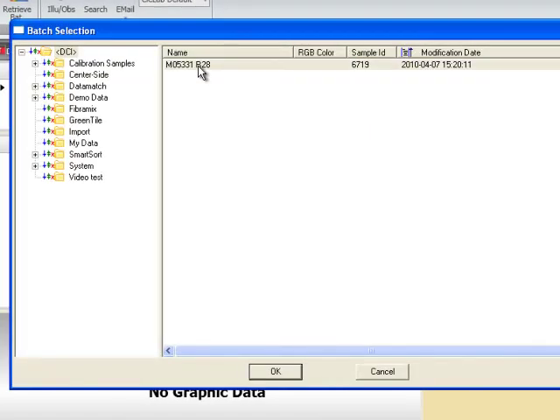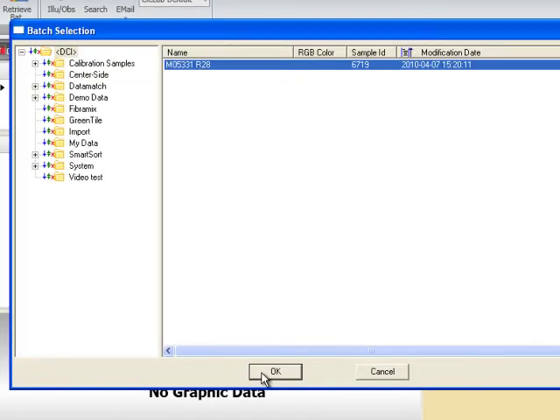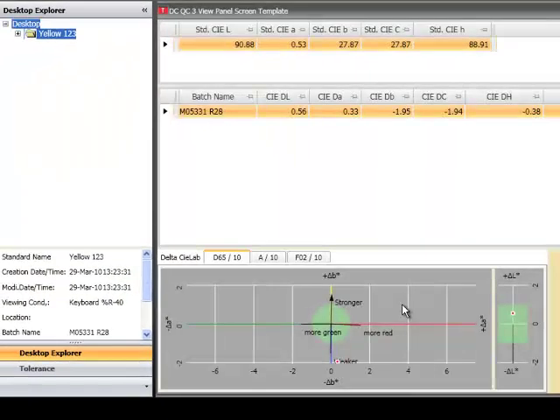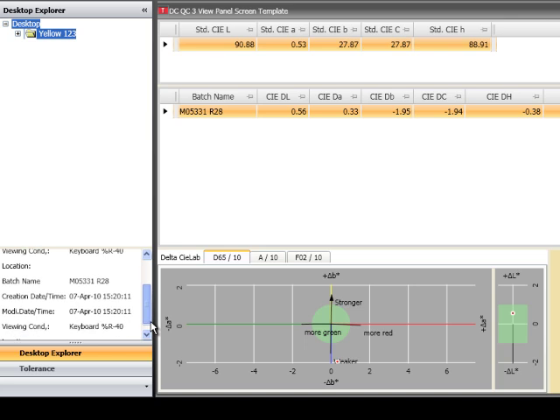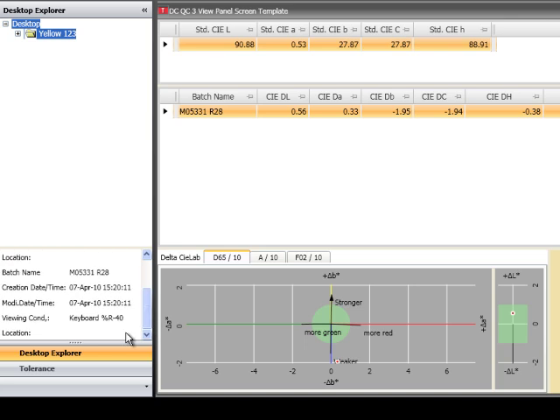Here we will retrieve a batch. The user still has the option to use command buttons to perform these tasks as well. Once a batch is retrieved, batch information is also available below. There is also the ability to click on the Tolerance tab and view current system and standard tolerances.